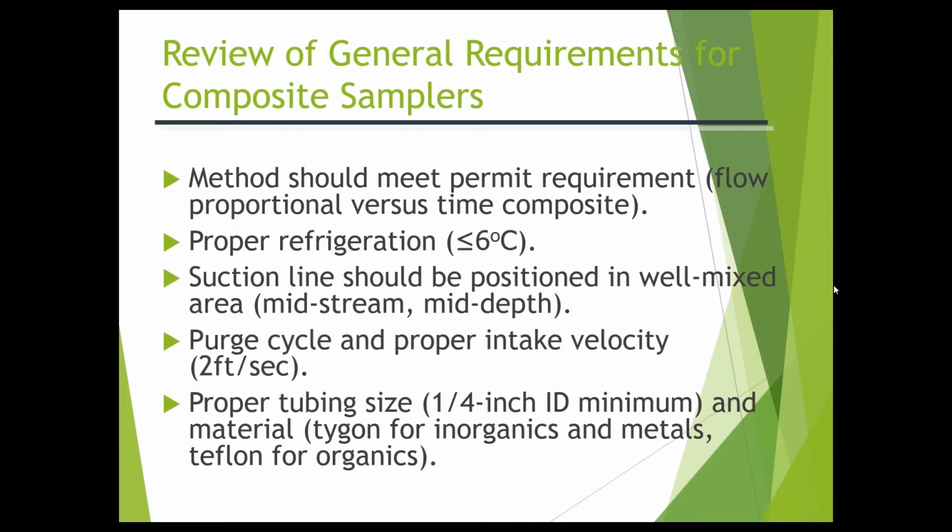And again, I can say southern states because I work in a southern state, the sunshine will take the Tygon and make it stiff like Teflon. It will dry it out. And so that's something we do check when we check the Tygon tubing. We want to make sure that it is malleable, flexible, rubbery, and not stiff like Teflon, which means it's heavily degraded. And that degradation ends up in the sample and can affect your outcomes.